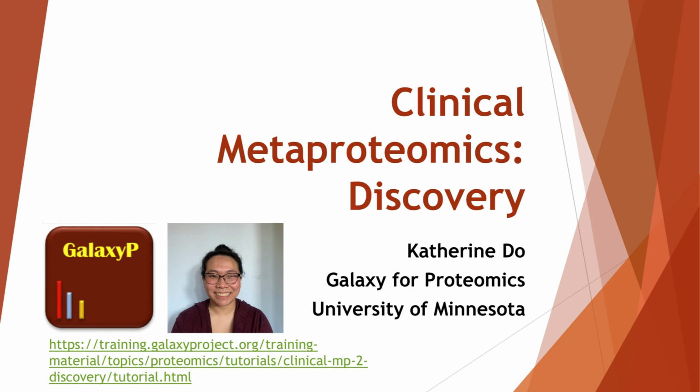Hello, my name is Katherine Do, and welcome to the video for Module 2 of the Clinical Metaproteomics tutorial. In this video, we will cover peptide discovery.